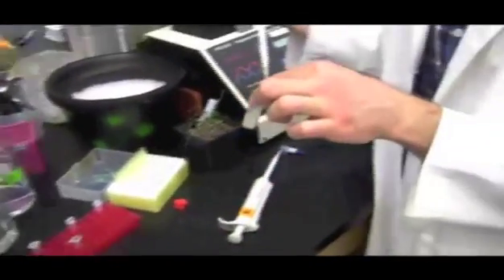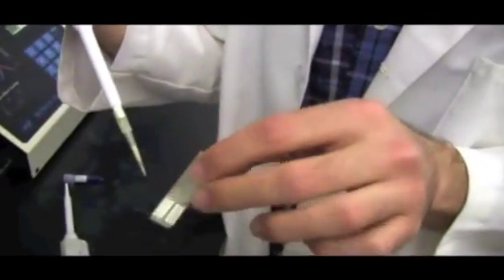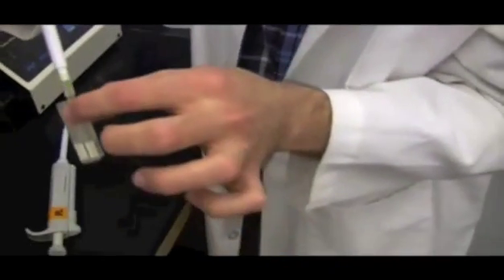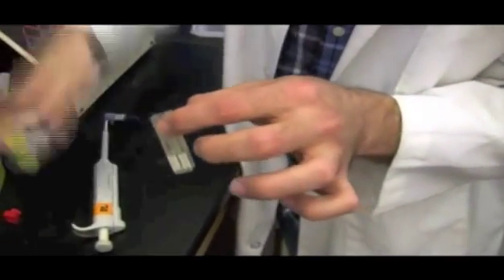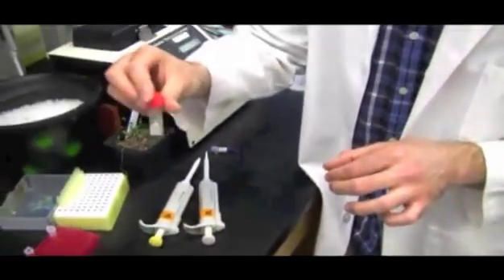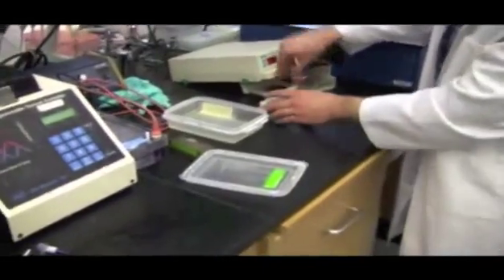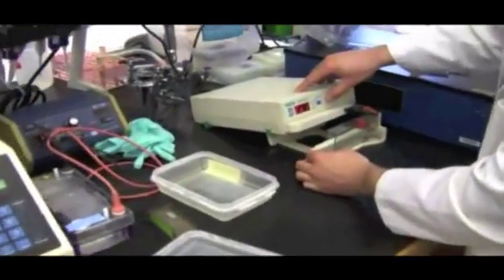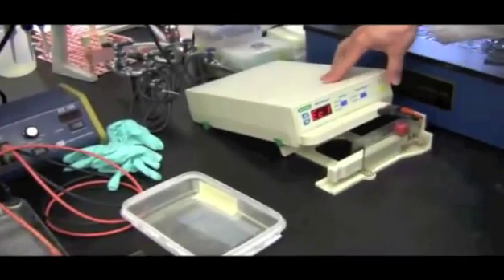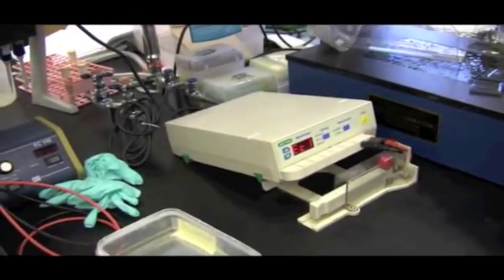Okay. So this is a cuvette, so you can see the two little metal things on both sides. So we can put a charge through here and that'll shock all the cells really quick. So I'm going to add this inside. Make sure it's nice and even. Alright, sorry little guys. So again, this machine will shock our bacteria, and if our DNA is on the outside of their cells, it may sneak its way in. That little noise means it worked.